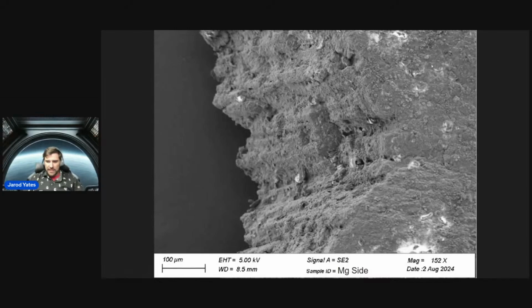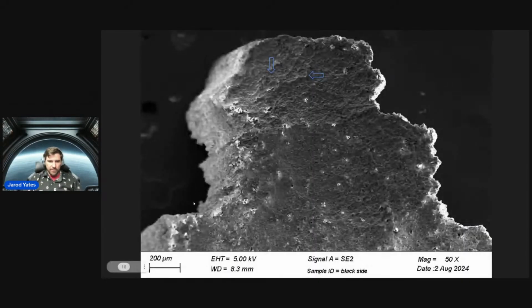All right. This is the magnesium side, the shiny side, and we can see the edge of it, how it has broken. We are only at 5 kV, so our brightness is turned way down. And right here is that delamination layer, right? It's like the bismuth magnesium zinc transition zone where it delaminated, where it sheared apart. A good takeaway from this picture is you can see the columnar breaking that we had here. In the next image, I'm going to show you how there's a specific shape or pattern or angular structure to these breakings. I'll make that point in another slide or two.